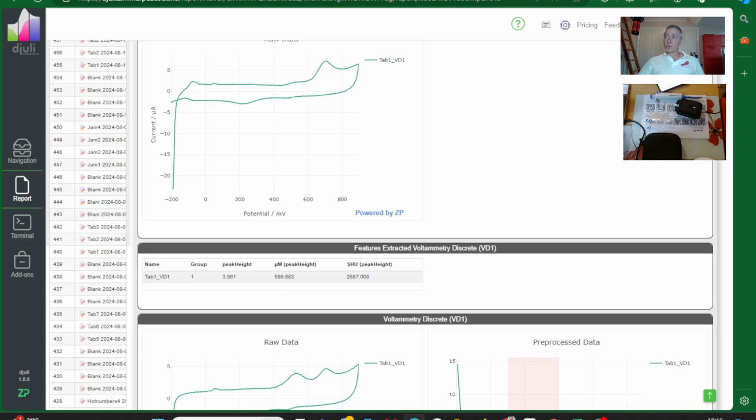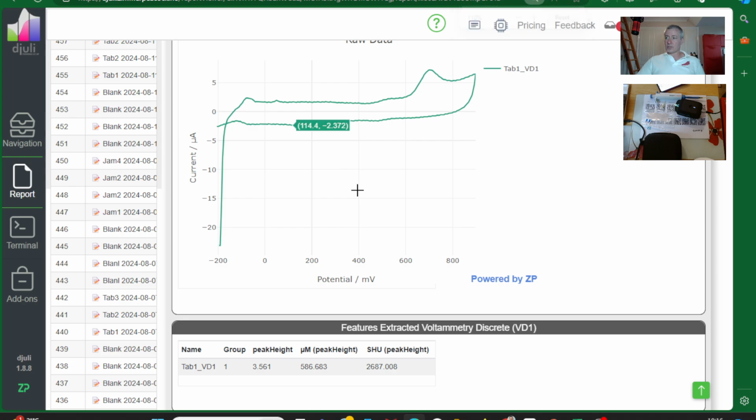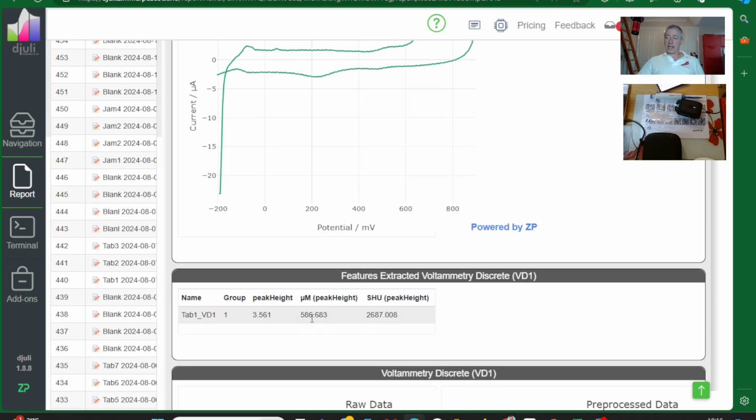Now this is quite small. I might be able to just zoom in a little bit. So I said 587 on the app. On the app, it said 587, but you can see here in the cloud, it's actually 586.683. It's a bit ridiculous. You don't need 3 decimal points, but that's what the cloud does. But when we show it on the app, it's a much more rounded number.